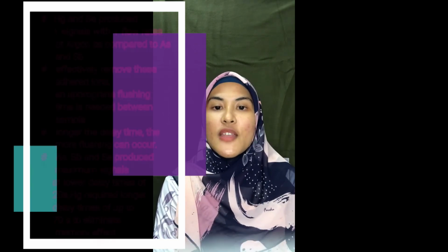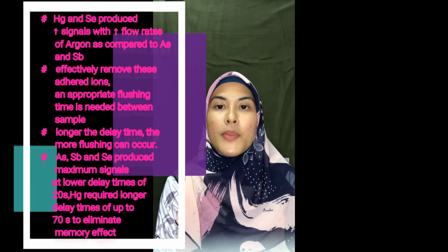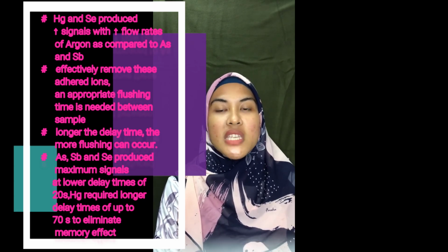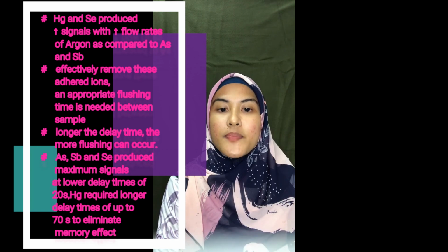Other than that, mercury and selenium produce the higher signal with higher flow rates of argon compared to arsenic and antimony, where dilution of hydride by excess argon occurred. Then, to effectively remove adhering ions, appropriate flushing time is needed between the samples. Flushing time can be controlled by instrument delay time. Longer delay time, more flushing time can occur. Delay time is optimized to ensure that the possibility of memory effect is eliminated.